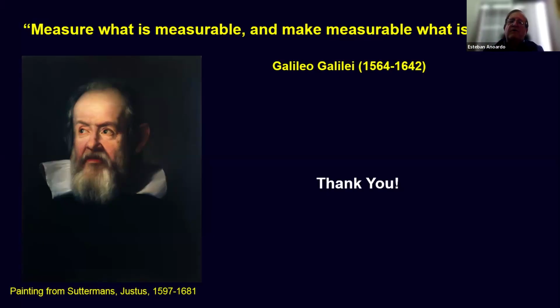You must validate your model. You should get data from other techniques. And once you are sure of what you can get from the data you have, with your model and with the fitting engine you are using, then you can use it in a standard way, and you trust the result.